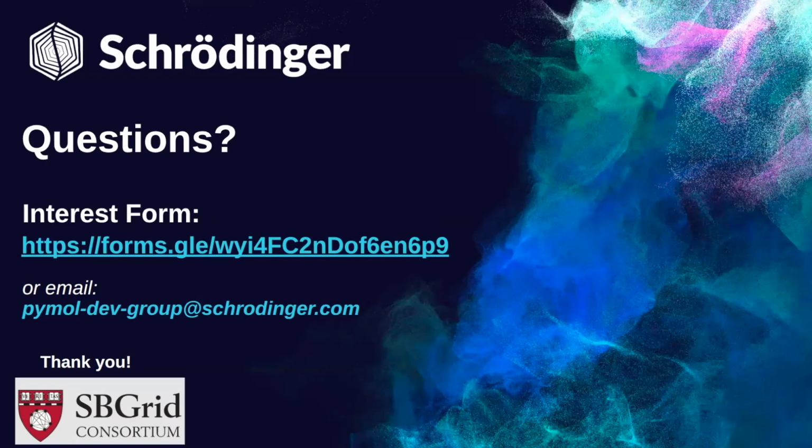And one question that occurred to me as you were talking about the rotamer fitting, and I think you hinted at this during the demo, which library is it using for the geometry? For the rotamer library, we use one of the older versions of Dunbrack's backbone dependent library for rotamers.